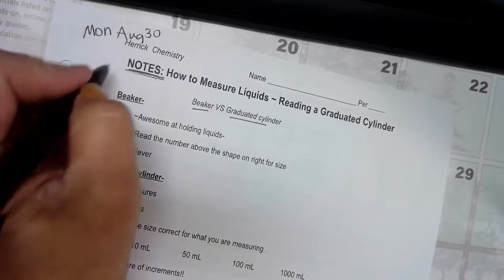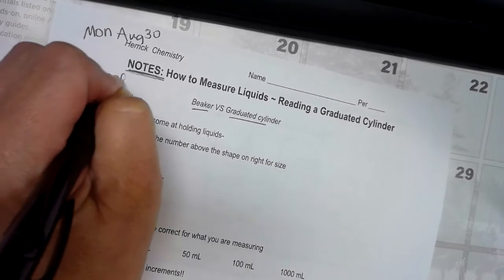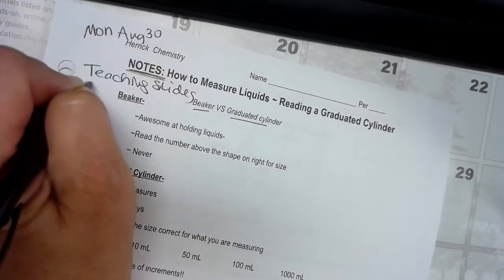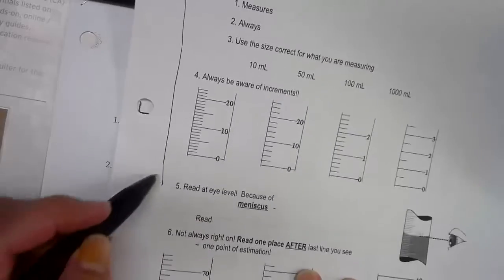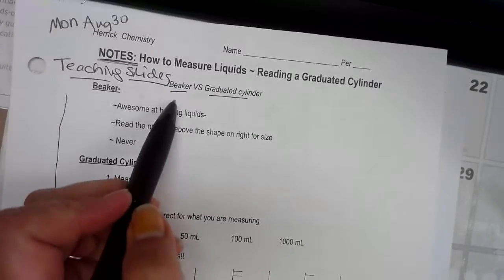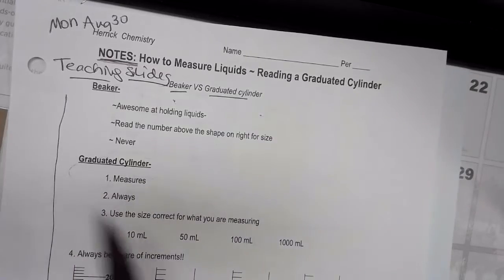In Schoology, there is a link for teaching slides. Look for those teaching slides, and that covers all of this right here, all the way down this whole page. It's mainly talking about a beaker versus a graduated cylinder, and that the graduated cylinder is better.